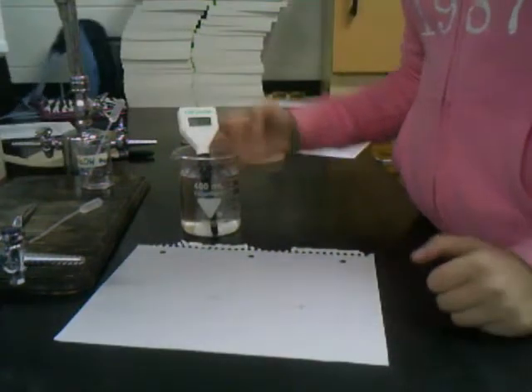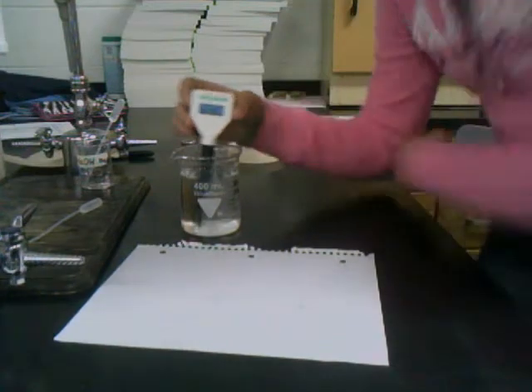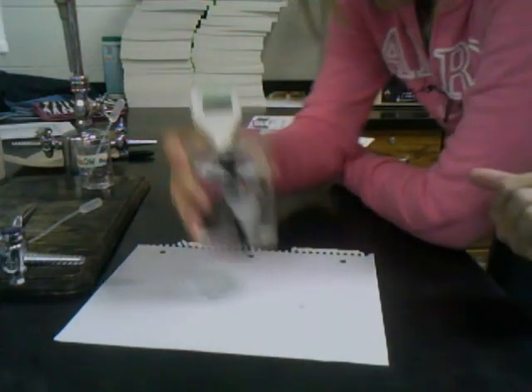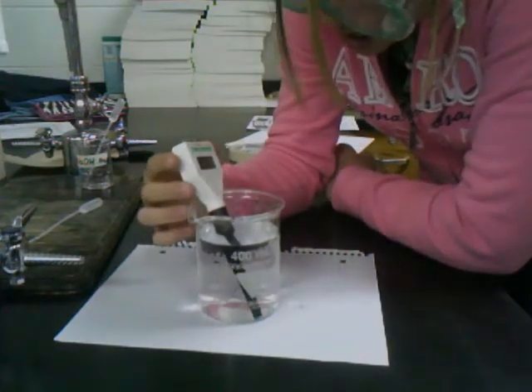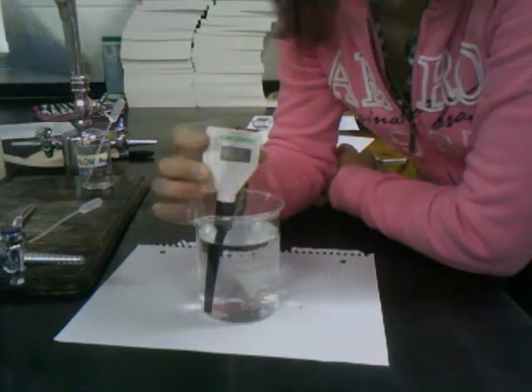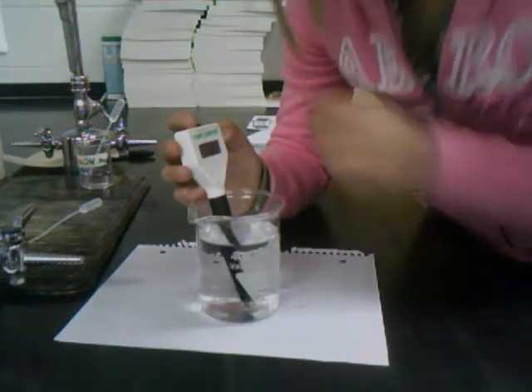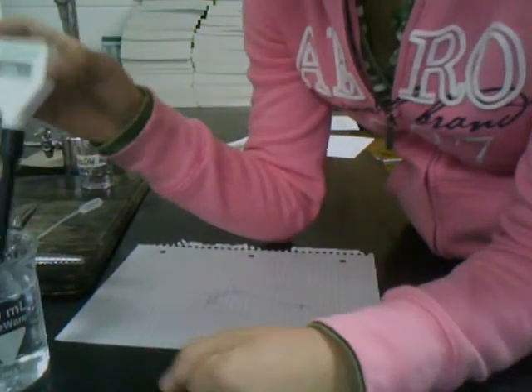Now that we've finished titrating all of our samples, we will find the pH using this digital pH meter. Right now I'm trying to get it to recognize that water is 7 so I can calibrate the pH meter. Now that it's calibrated to recognize water is 7, which is completely neutral, I'm going to take the pH of sample 1 of our unknown.